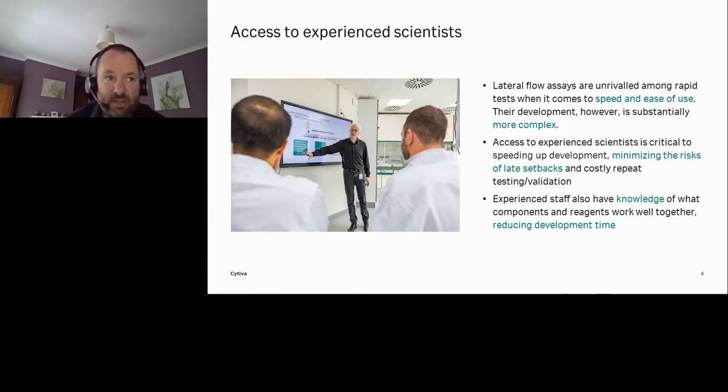The third point is that experienced staff also have knowledge of what works. And that can be quite key because when you're developing a new platform, you have to start from complete scratch, but you might have a scientist who knows what detection particles work well with what membranes and what pads, for example, and it can significantly reduce your development time as a result. So all of these are key to making sure that you're getting through your development process as smooth as possible.